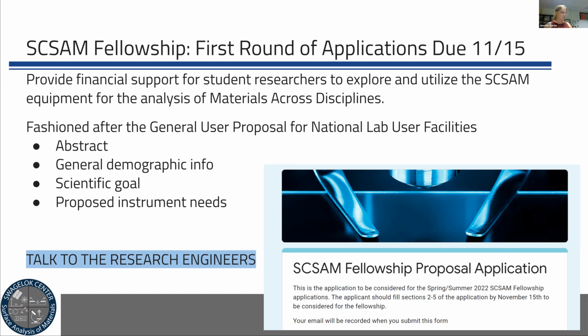We envision that the scope of work is somewhere on the order of 2 to 6 hours worth of microscopy time. It may make a figure in a paper or maybe the foundation for future work in a proposal. The application is only open to PhD researchers at this point in time because of where the money comes from, but that is what we are doing.